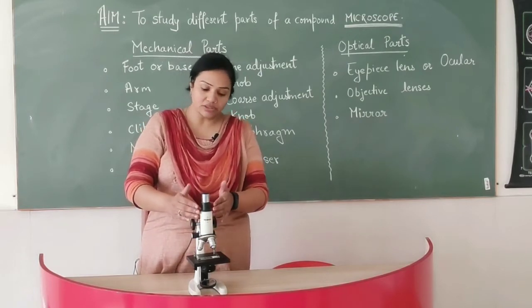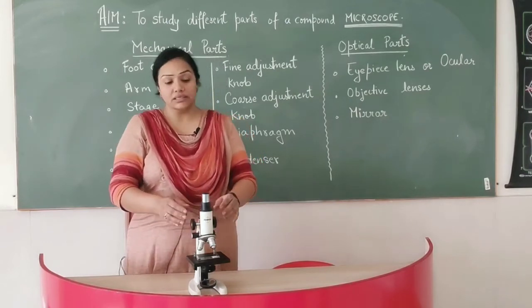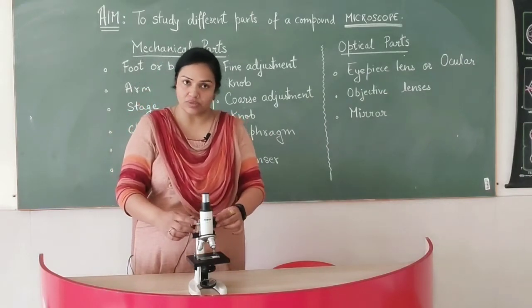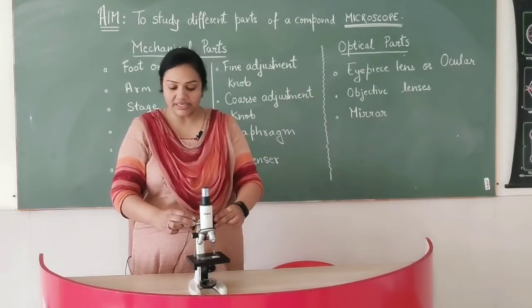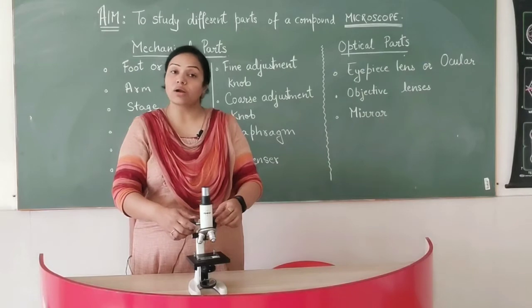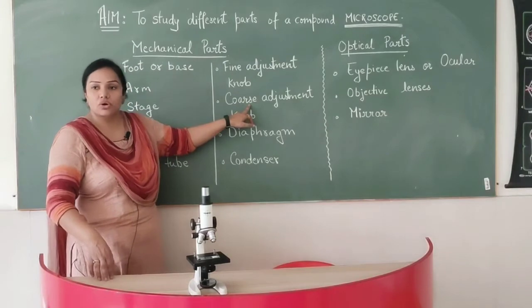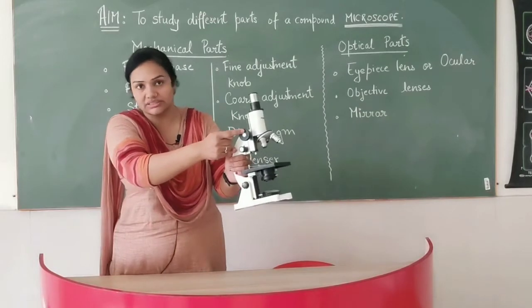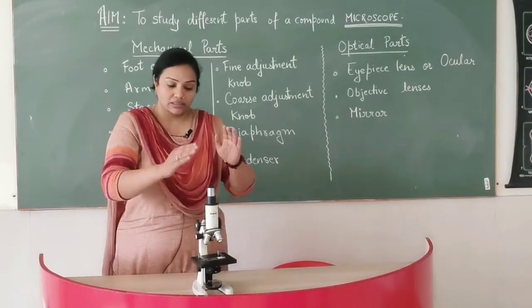Now coming to the adjustments. These adjustments help in focusing the object. The upper one, this bigger one, as you turn it, the body can move up or it can move down. This is called course adjustment knob. This course adjustment knob helps to move the body of this microscope up and down.